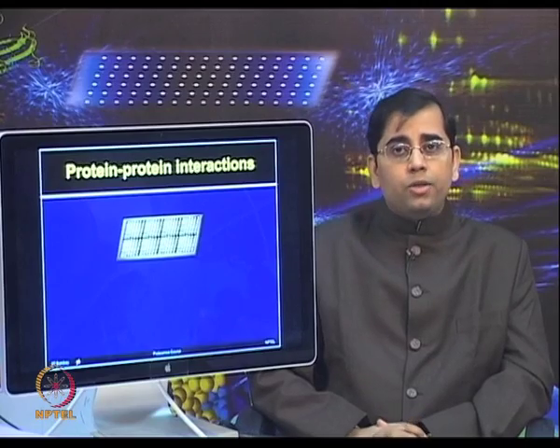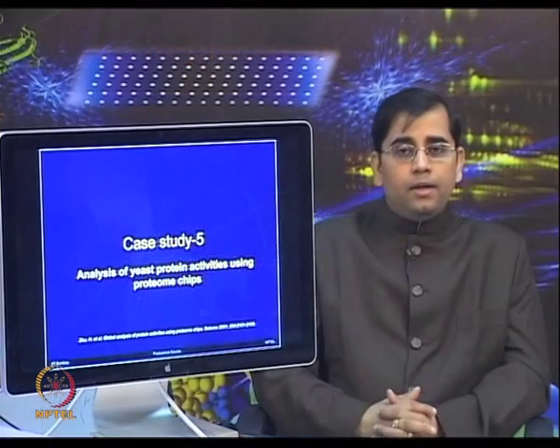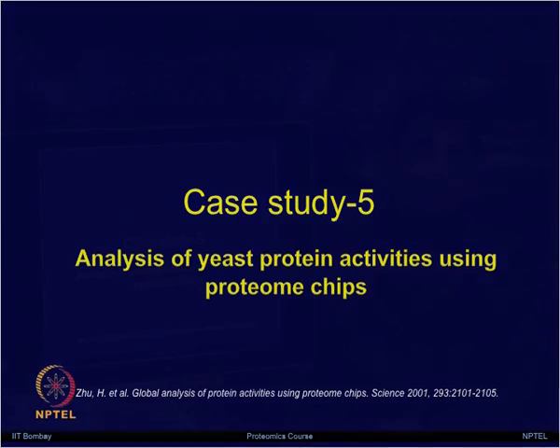Further, they used the protein chips for detecting protein interactions, and they discovered 4 novel protein partners which interacted with HY5.